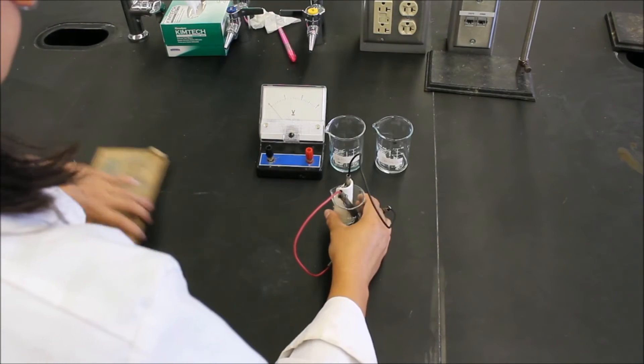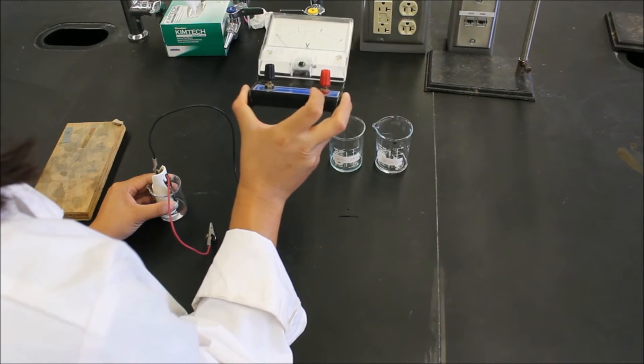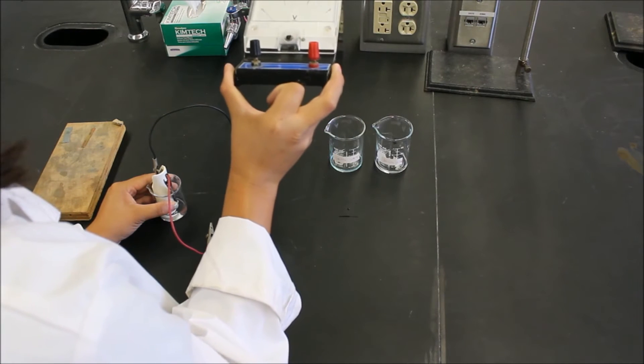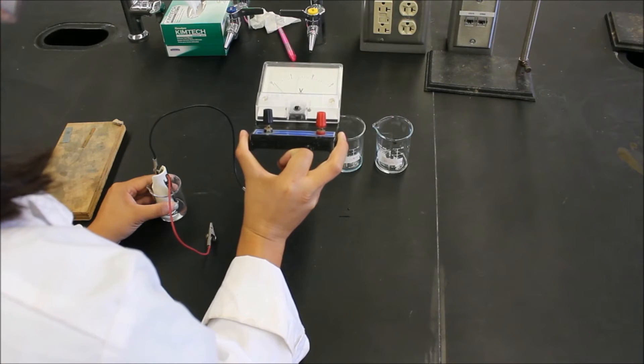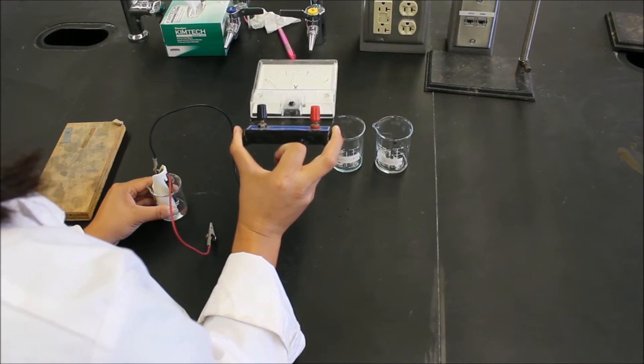After we have that, we want to connect these to the voltmeter. Now you'll notice that there's a plastic part of the post and the metal part of the post. From 101, if you remember correctly, plastic is not a very good conductor. So we want to make sure it's connected to the metal part of the post.